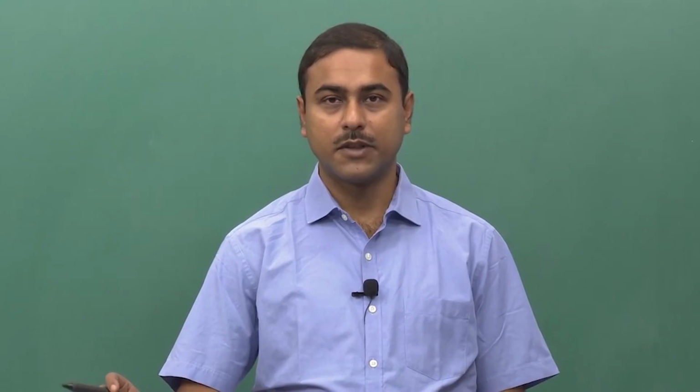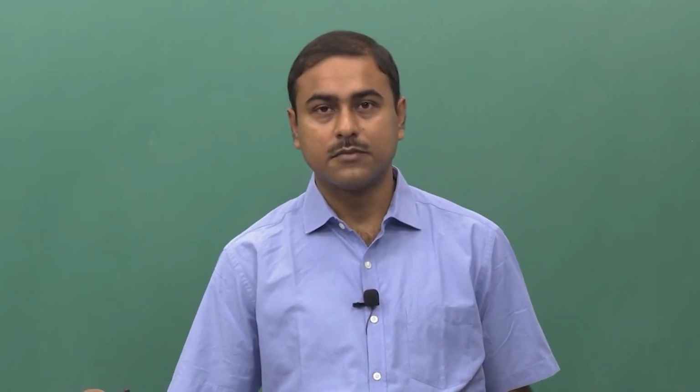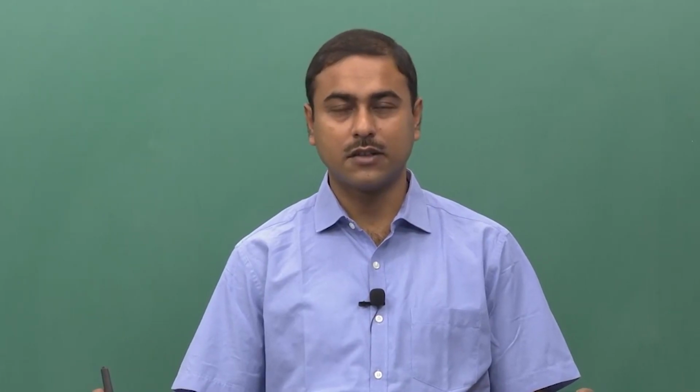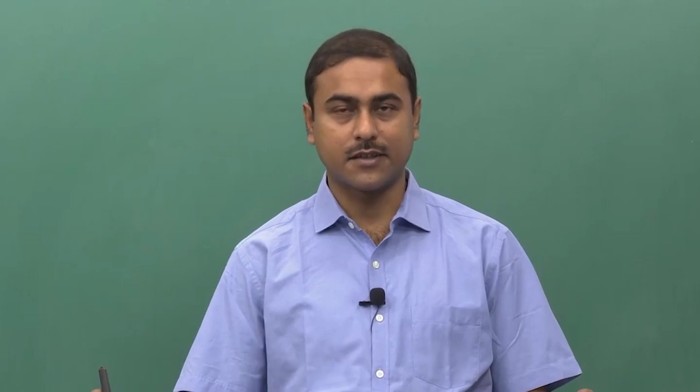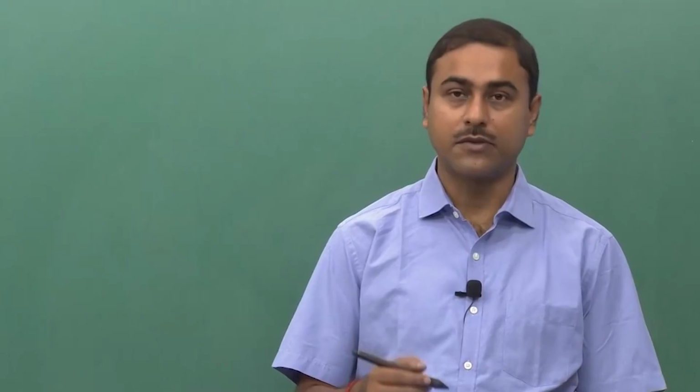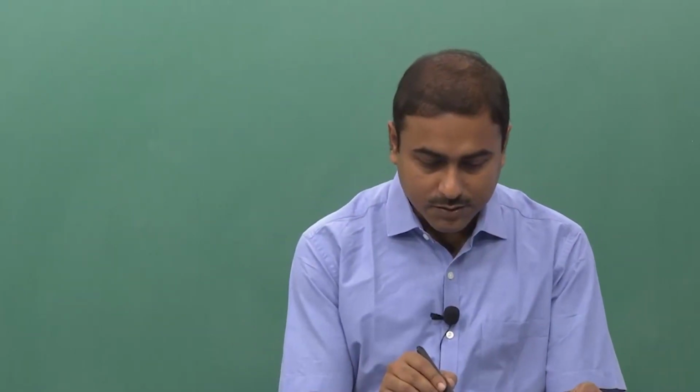Welcome to the 12th lecture of the series. Till last lecture we were discussing how to measure the correct emission and excitation spectra, and in that regard what we have learned is that if this is my fluorimeter, here is my lamp, and the desired excitation wavelength is selected out of this excitation monochromator.